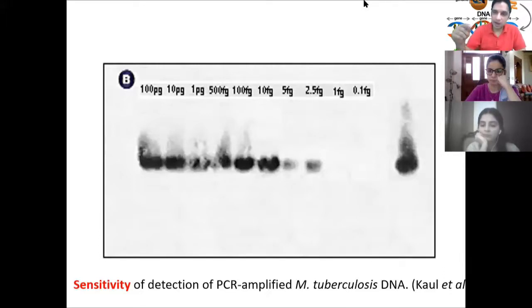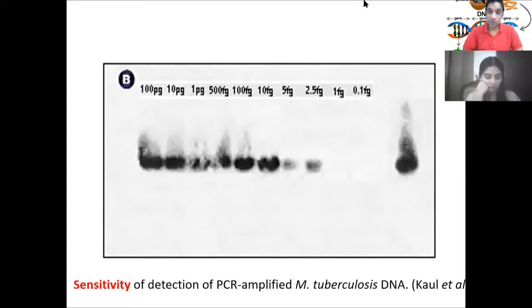Remnant DNA, RNA fragments of the viruses are there. So if you are using so sensitive technique of PCR reaction, that will give you a positive results with those fragments and remnants of the RNA as well. तो एक बहुत सारी एक्सपर्टी चाहिए इस चीजों को फिगर आउट करने के लिए.